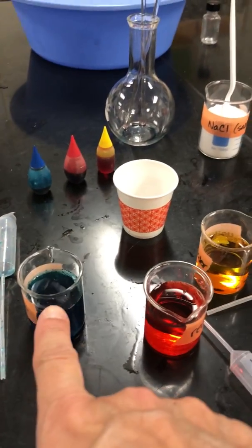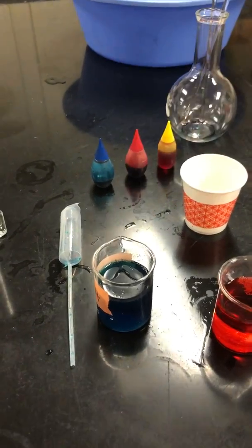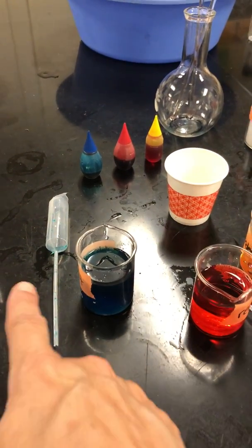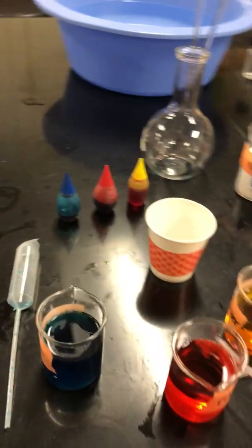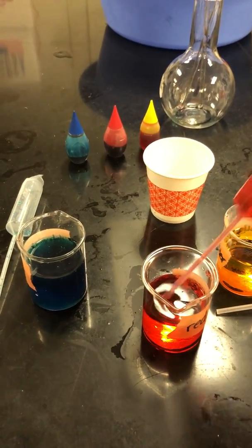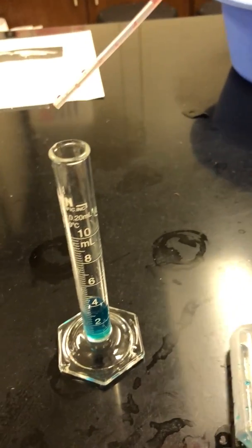We're not reacting this with anything, and so it is okay to put the stuff back in there. If we were doing chemical reactions, I would not have put that back in there because I would not want to contaminate my solution. But what you see happening here is all physical, people, all physical. So just put that right back in there.